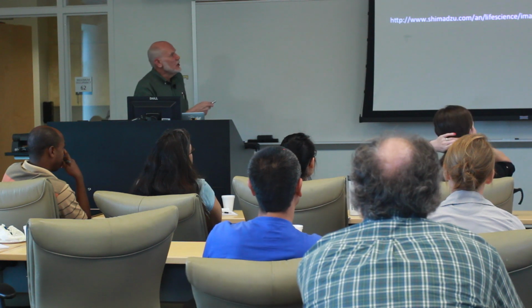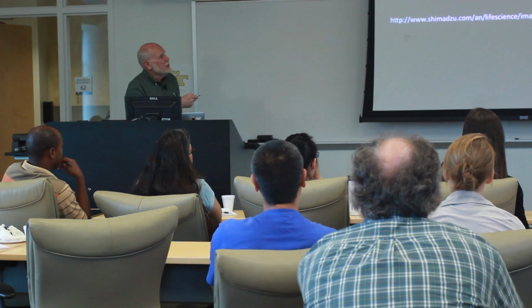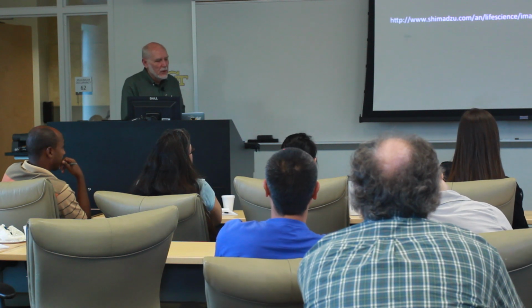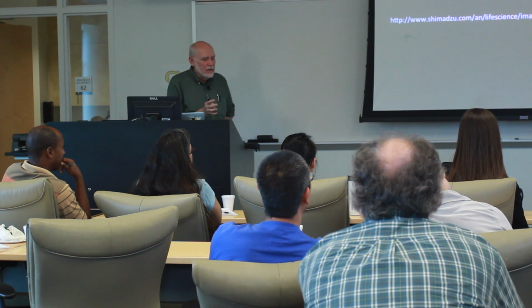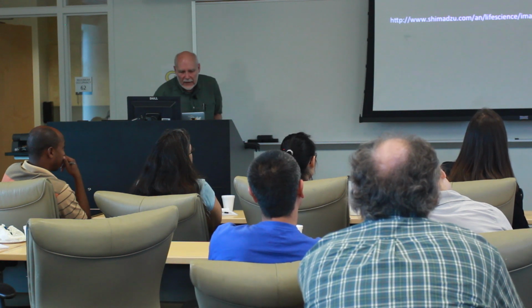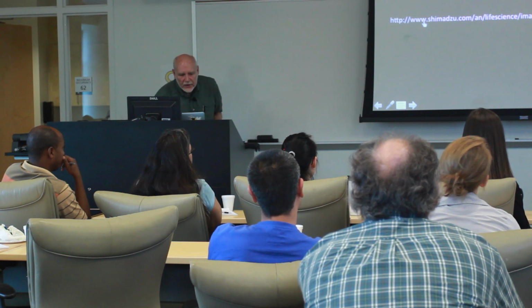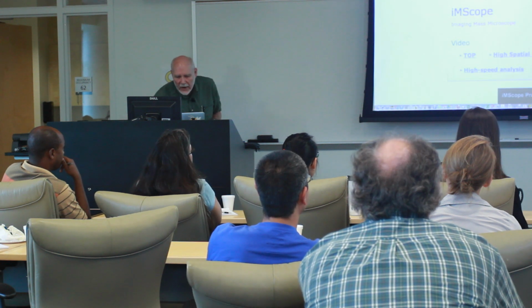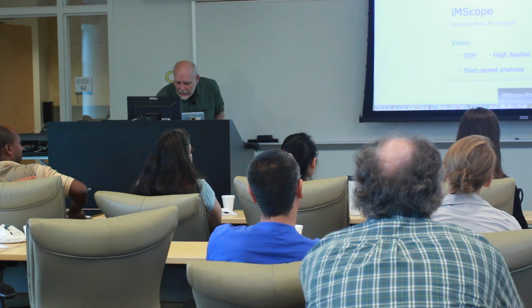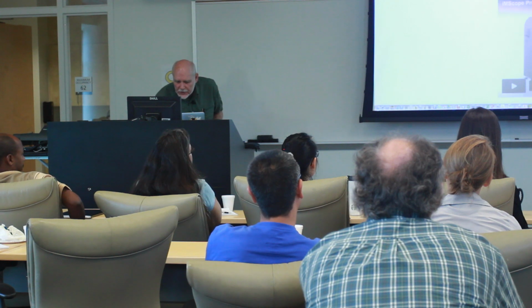So mass spec imaging, as I hope I've shown you, is on a trajectory to become a standard research tool for taking the power of mass spectrometry to look at molecules and to put them into a biological context of where they are in situ. Indeed, there are companies now that are making instruments that are designed specifically for this purpose, and I want to show you this short video from Shimadzu about a new instrument that they've developed. If I can get the screen in the right place to show you.